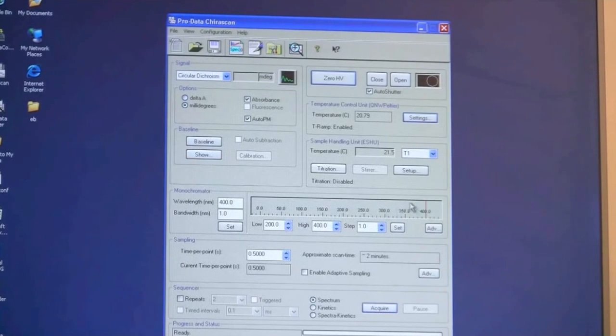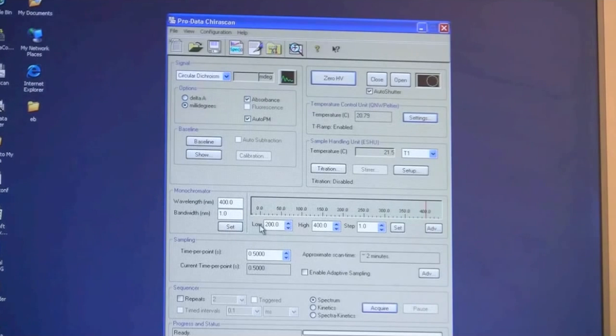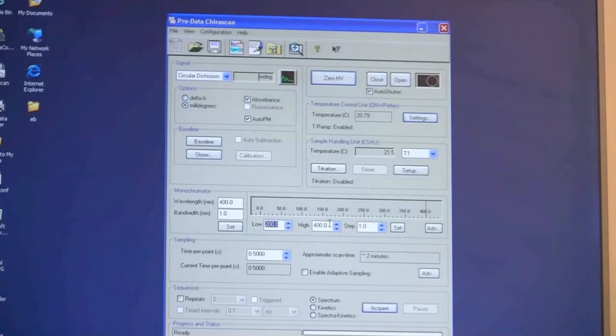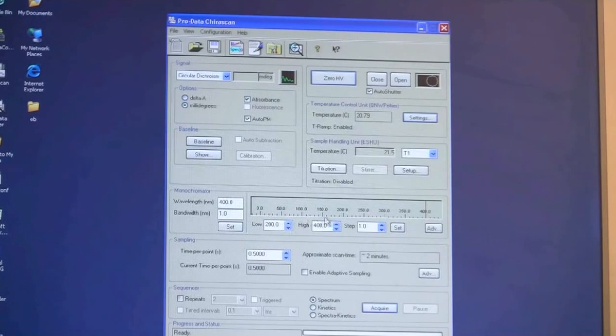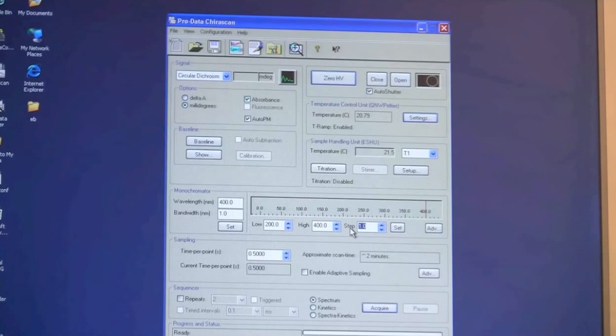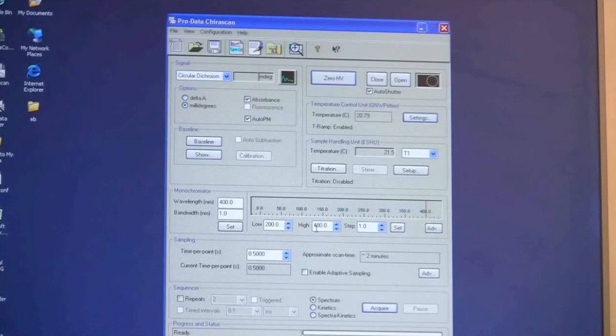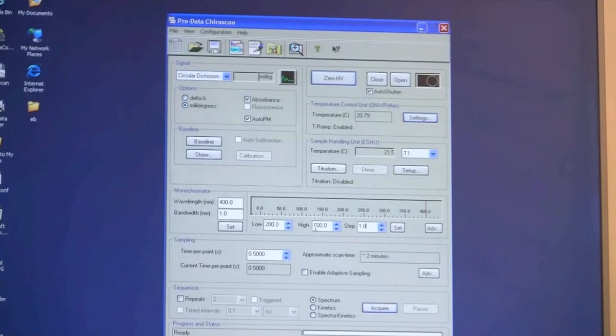Underneath all of that you have the monochromator range. You always set up a range of scanning. The software or the instrument is always scanning from the highest to the lowest. The step is the number that you are going to in terms of wavelength. So at the moment it is set to one. It means that it will go from 400 to 399 to 398 and so on.